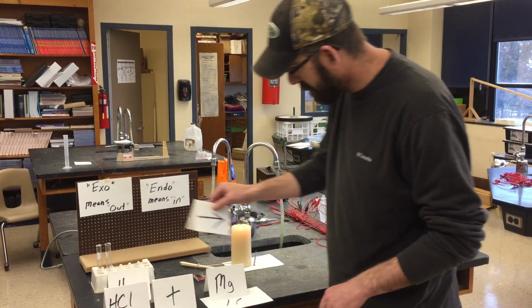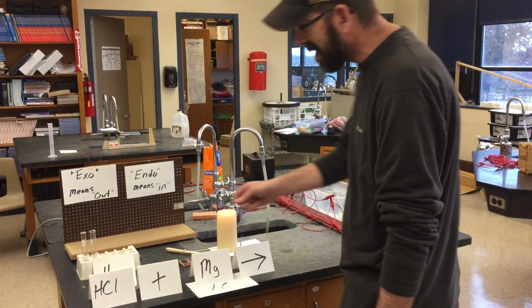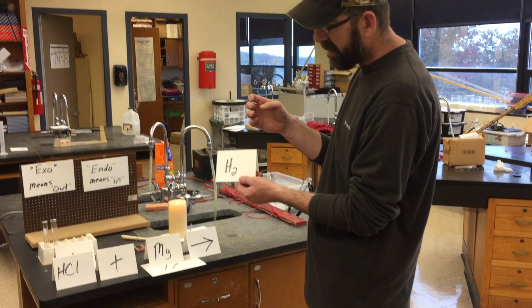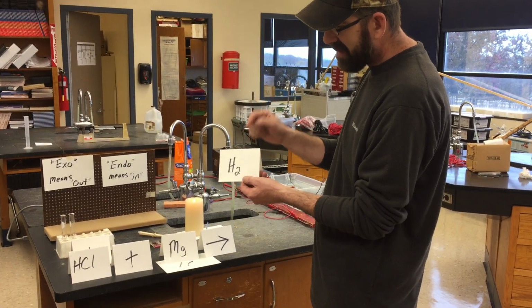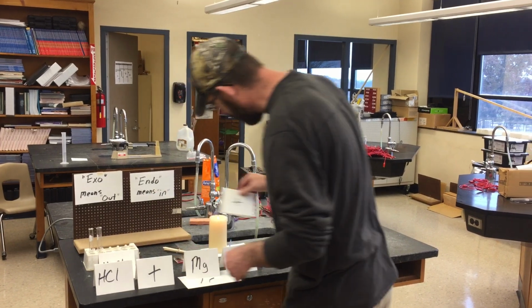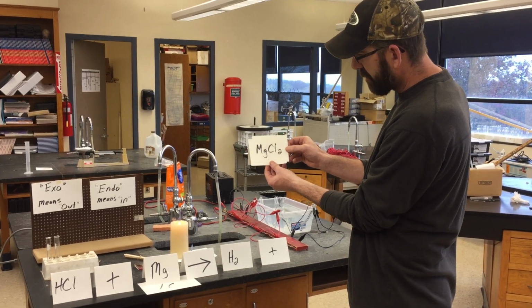The arrow signifies that the chemical reaction is going to take place. Okay? Reactants are going to create products. After the reaction takes place, we're going to make hydrogen gas, H2. This stuff is burnable. It's very clean burning, can be used as a fuel. We're going to demonstrate that that H2 is present in the reaction. You'll get to see that. There's our H2, and then we're going to have another product here after the reaction, which is going to be MgCl2. This will be what's left over after the hydrogen separates.